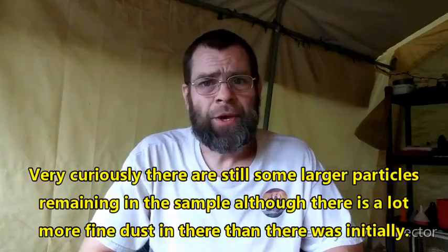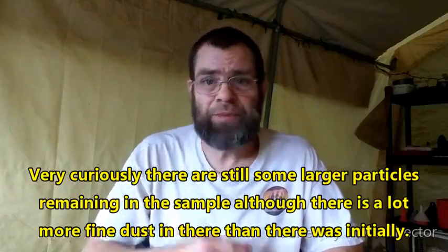Now, the bouncing and breaking uranium red. This is a phenomenon that continues to intrigue me. I have not looked at that sample of uranium red since. I wanted to let it sit for several days and see what it did. So we'll take a look at that, plus the other batch that I made, which was me figuring out exactly how to do uranium red by this method. I saved that and dried that as well. So we can take a look at both of them under the scope at the end of this video and see what they look like, see if the new batch is doing the same stuff as the old batch did.